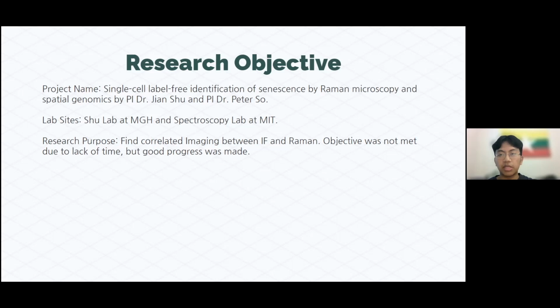And so at my time there, my research purpose was to find the correlated images between the IF and Raman. And my objective was not met due to the time constraints, but good progress was still made, and I was still able to educate myself a lot in the field of senescence and Raman microscopy.